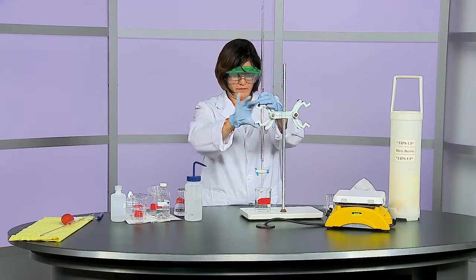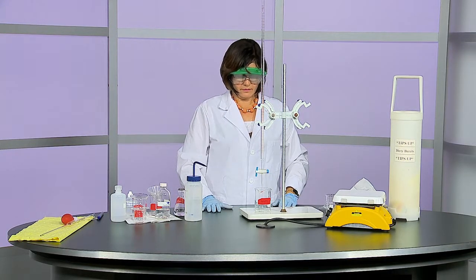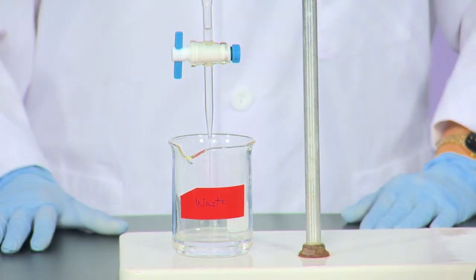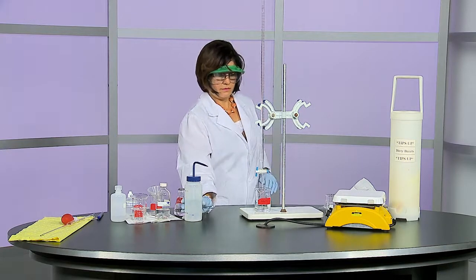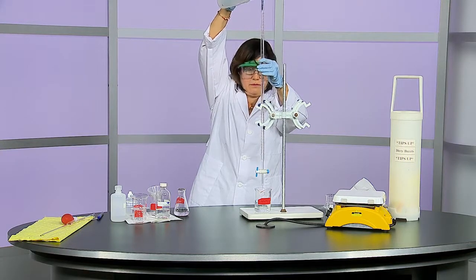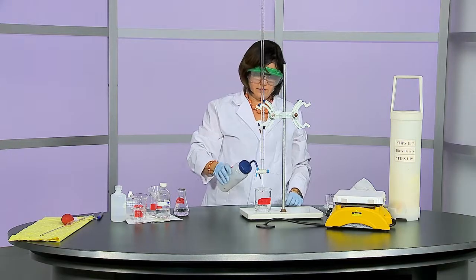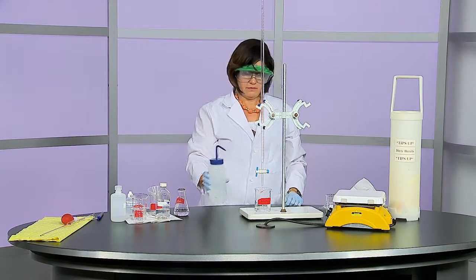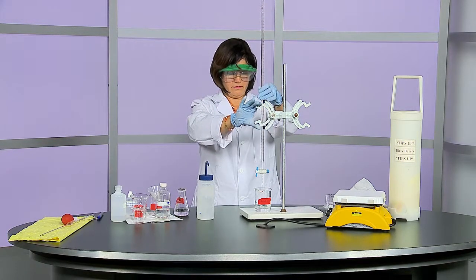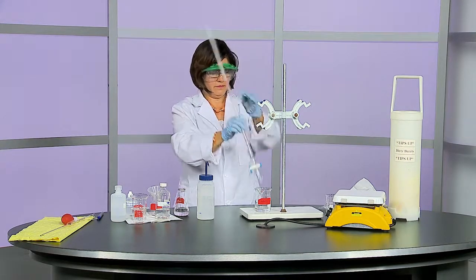When you are finished completely with the burette, place the waste beaker below the tip and open the valve to empty it. Once empty, rinse the burette from the top with your wash bottle. Collect the rinse in the waste beaker. Gently place the burette in the burette canister, tip up with the valve open. It will be properly washed by the stockroom personnel.